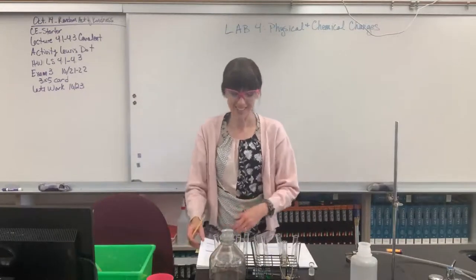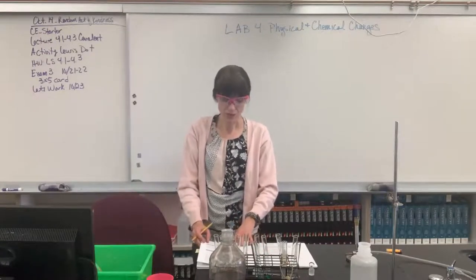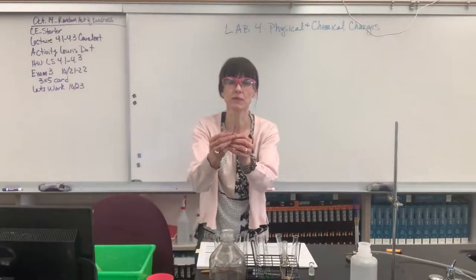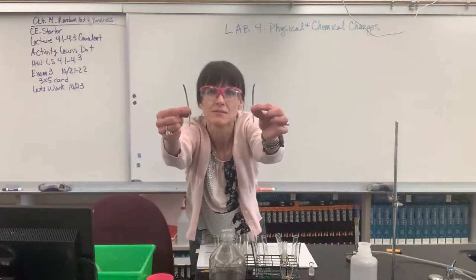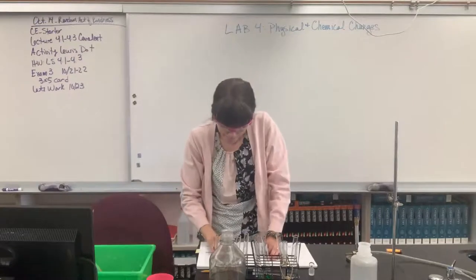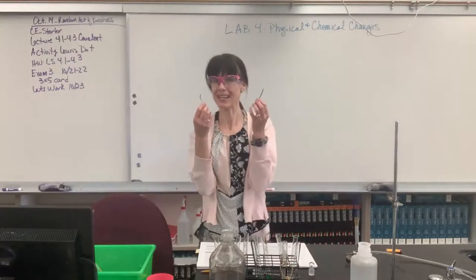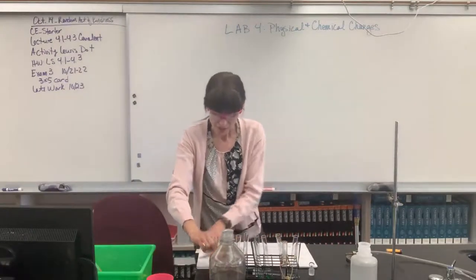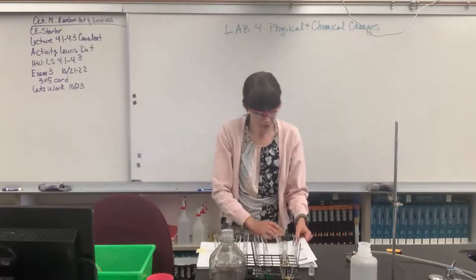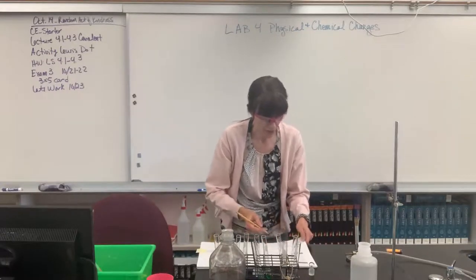Almost done, we have one more part. And you're gonna love this part. So it's part E, combustion of magnesium. It says obtain 2 3-centimeter strips of magnesium ribbon. So here's my magnesium ribbon. They're just little pieces of metal. They call it ribbon, but it's like a strip of metal. Let's see here. Record the appearance. They're shiny. It just looks like shiny metal. So I'm going to come to page 54, where it says appearance of sample before, a shiny gray.